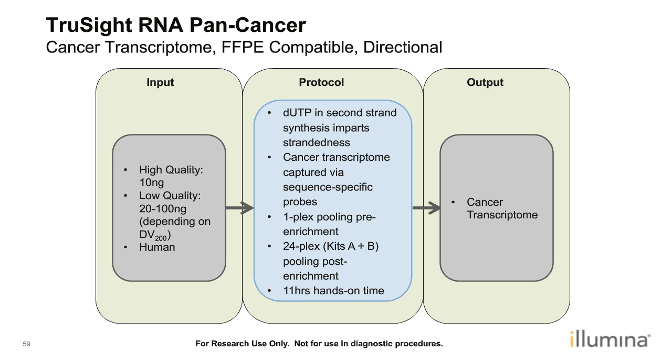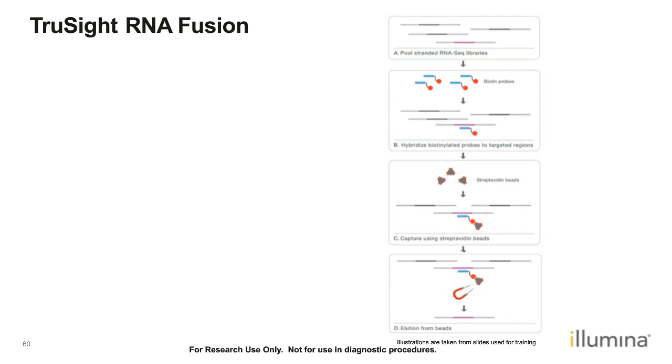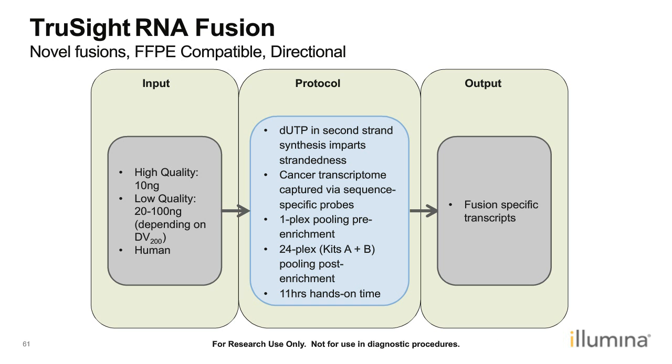Same can be said for RNA fusion, so you'll see a pattern here. As you can see, it's the same enrichment workflow, but here we are targeting fusion-specific transcripts. And thus, our output will reflect that.